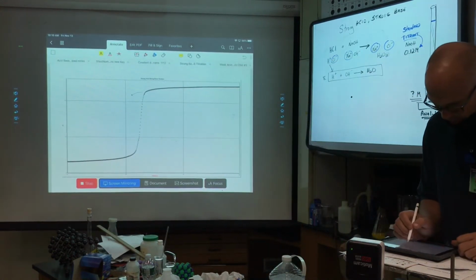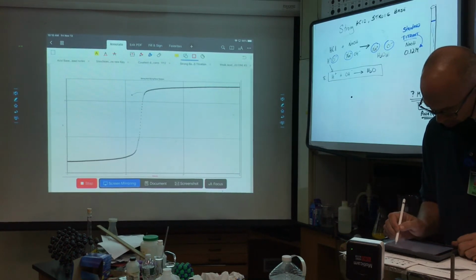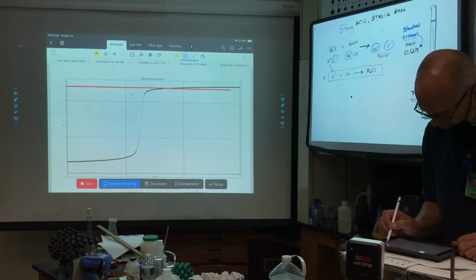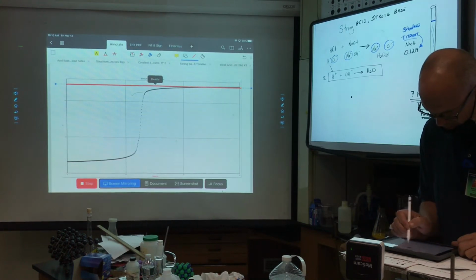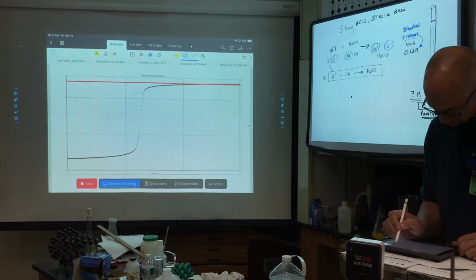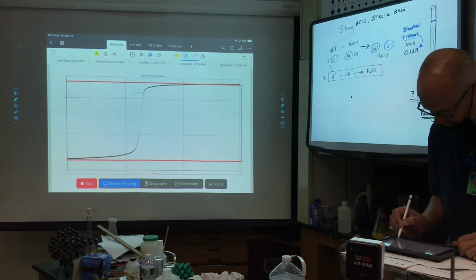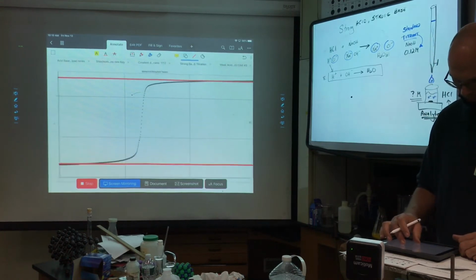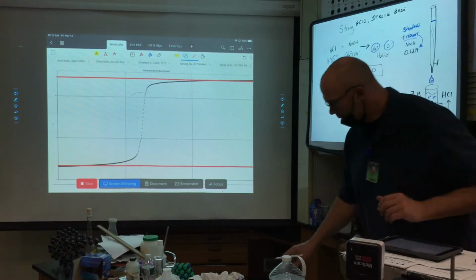So there's probably a better way to do it here. If I insert a line, edit PDF, annotate shapes, and I'll do a line. So I got that, and then do another line. Make another line. Move that up. And then I'm just going to measure. Now, let's try a measuring tool on this. Probably not. But I'm going to use a ruler.